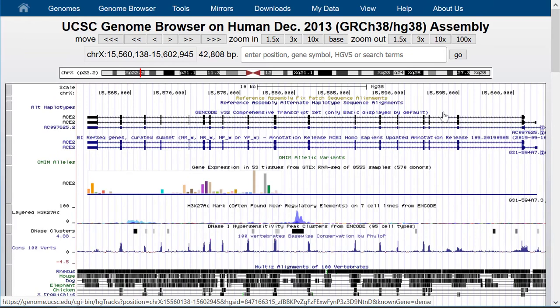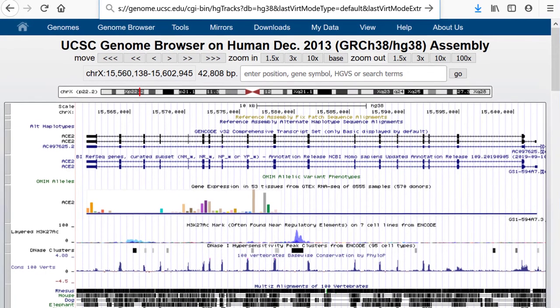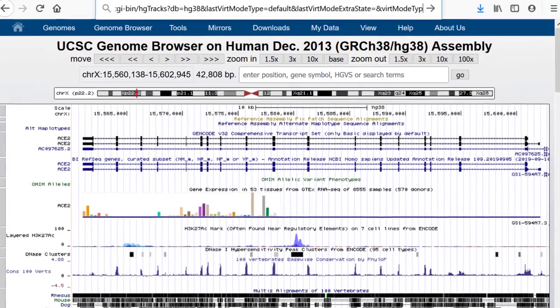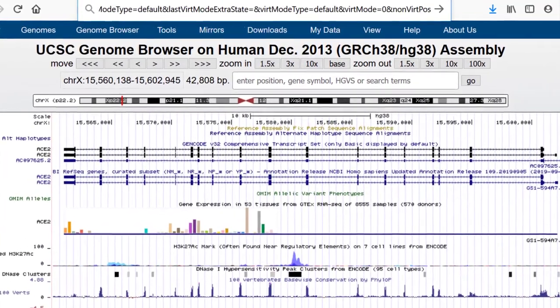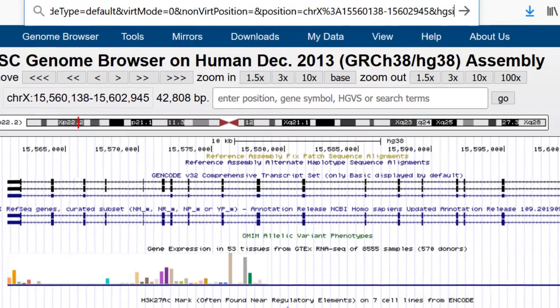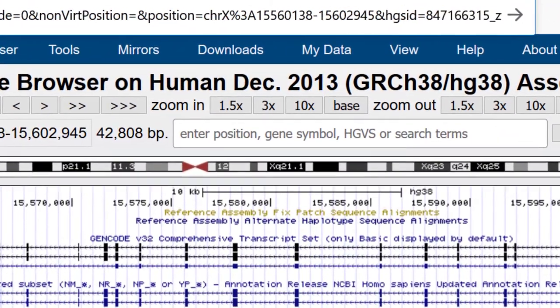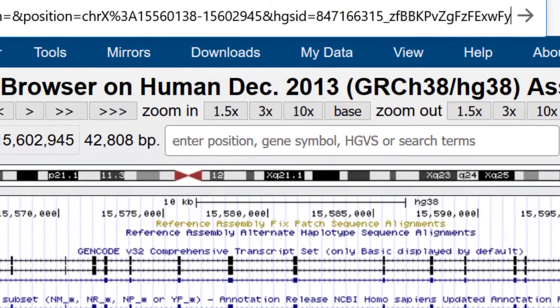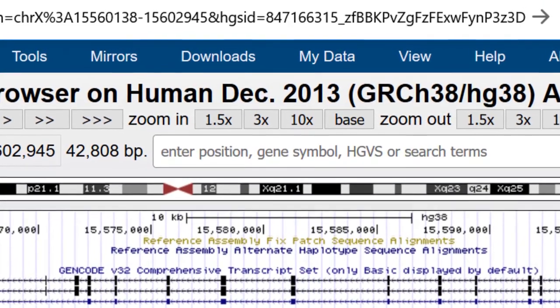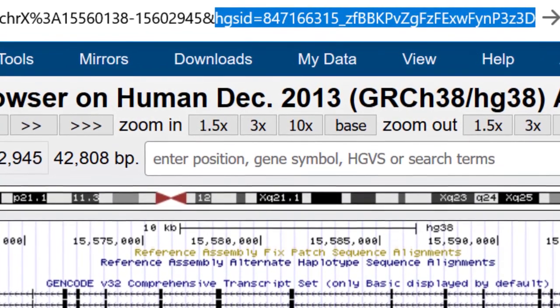One of the first things you will want to know is you cannot simply copy an existing URL and send it to someone. The URL contains a string of characters that refers to a cookie in the UCSC system. That's how the browser knows how to get back to your location when you come back. If you close the browser and come back in a few days, we look up your settings based on the cookie saved on your machine and return to your last position and settings.